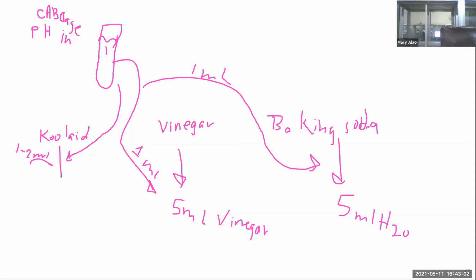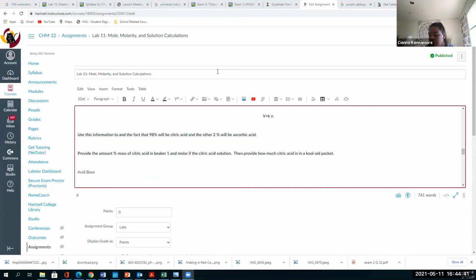Okay. All right, so just to make sure I have everything, I have my 3 different measurements from the tube for the foam, and then the pH for the Kool-Aid, baking soda, and vinegar. And then technically I have the acidic test or whatever, but it's not going to be usable. So is that all we needed, right? Was that those 3? So we take out where it stops at, right? That is correct.